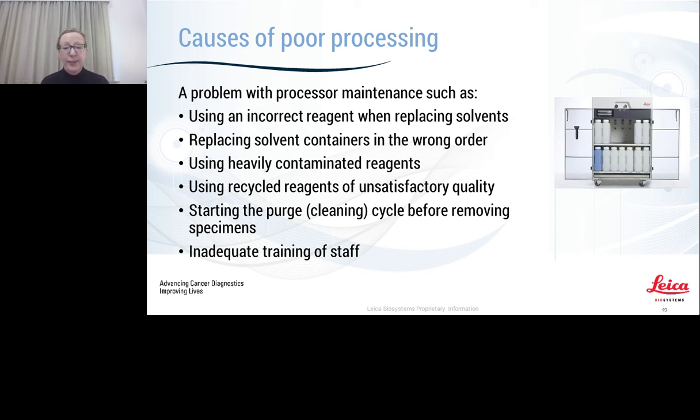There may be maintenance issues with your instrument. Every instrument will need to be maintained well. So make sure that the maintenance is kept up. Also make sure that we always use a correct reagent, that when you do replace the solvents, if you're taking them out manually, that they go back in the right place. Be careful of heavily contaminated reagents. Using recycled reagents of unsatisfactory quality, recyclers will give recommendations on how pure the final product will be. So just remember, most recycling of alcohols, the recyclers themselves would say that their product at the end is perhaps 98% pure. Remember that if you are using it as 100%, you take that into consideration, that you'll now have 2% and then maybe more of water in your final product.